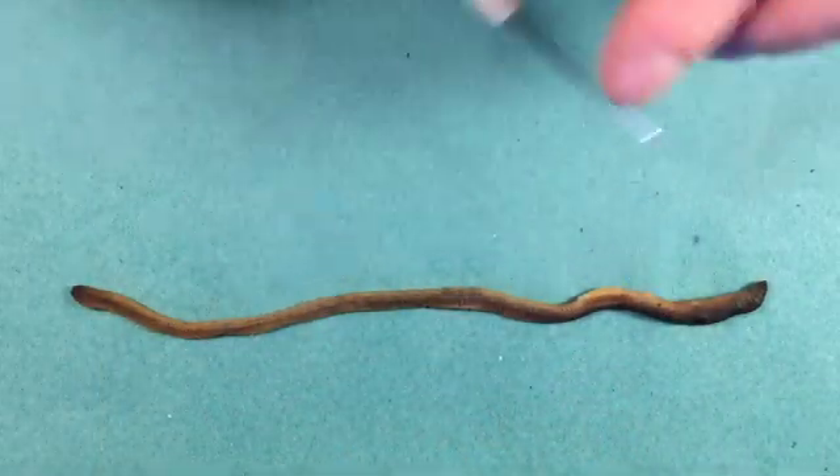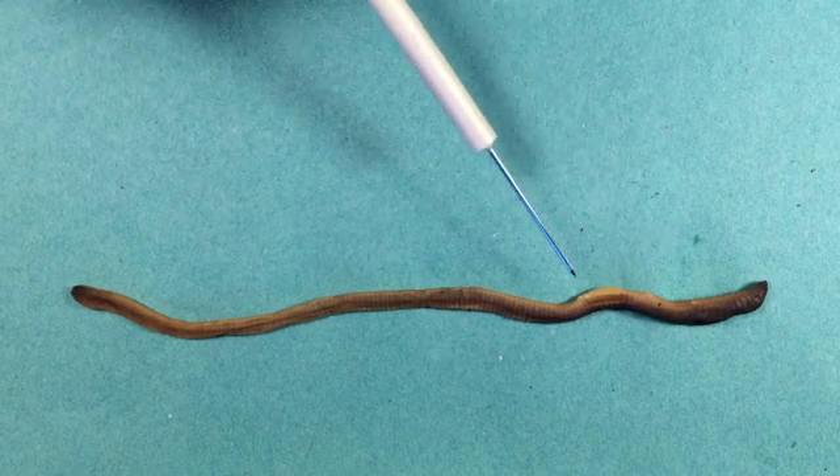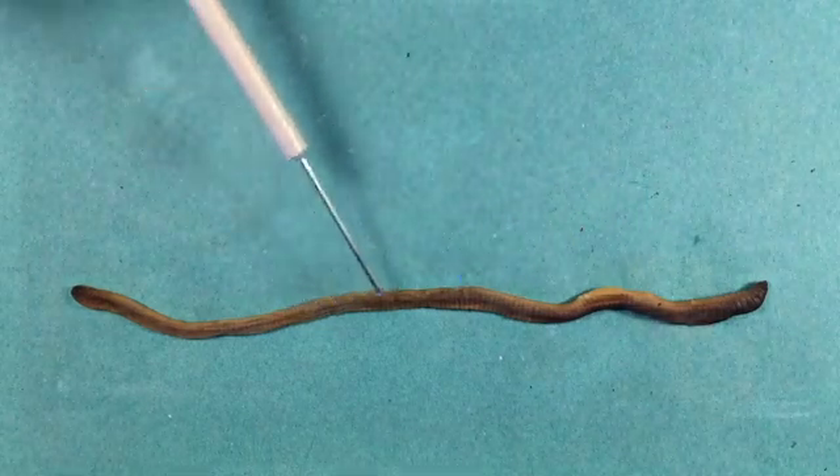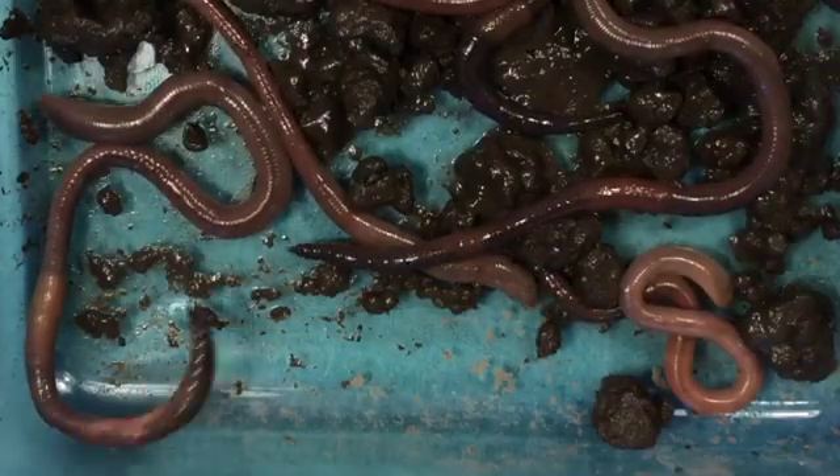Worms don't have any gills. Looking at this worm, there aren't really any obvious external adaptations for gas exchange at all — the body surface is quite smooth. But if we look at live worms, we can see they're very active, and these muscular movements would help gas exchange.